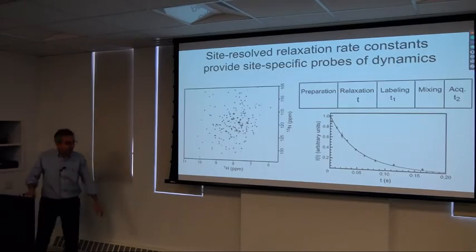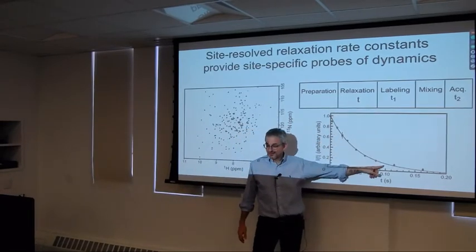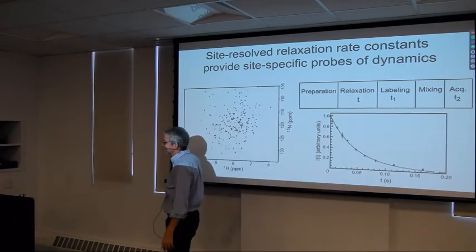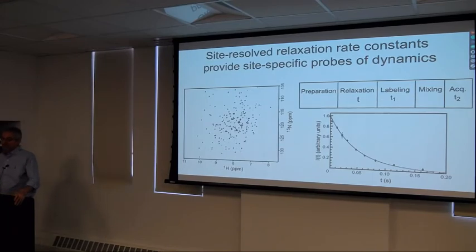So we know that if we were to go back to this kind of curve and measure these data over a day where our room temperature is fluctuating because the building is having a hard time equilibrating. This happens at Columbia frequently at this change of seasons when the air conditioning and heating aren't well balanced.